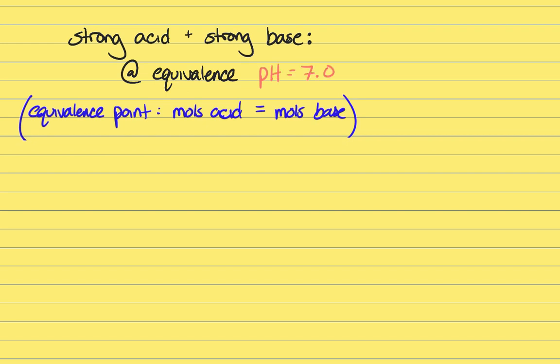And that's also an idea that we talked about when we were talking about acid-base theory in class, that pH will be 7 once you get a full neutralization because you're only making water and then a solution of a conjugate base that's not very strong, right? The conjugate bases of strong acids are really not good conjugate bases. So pH is 7.